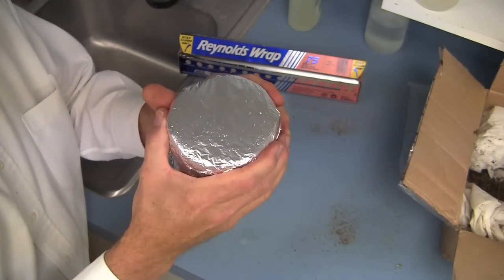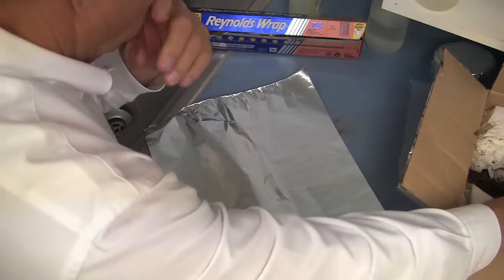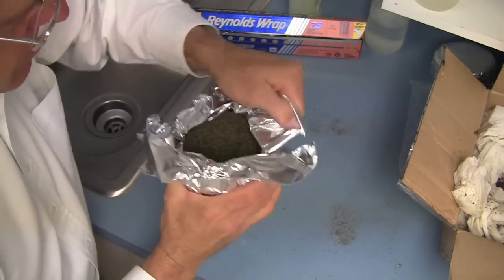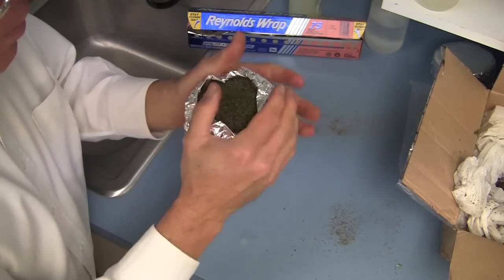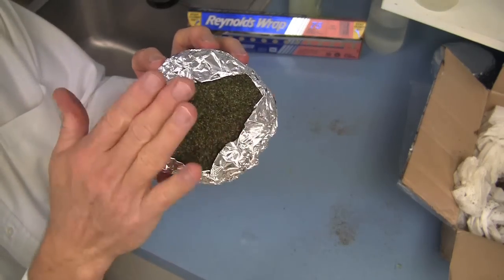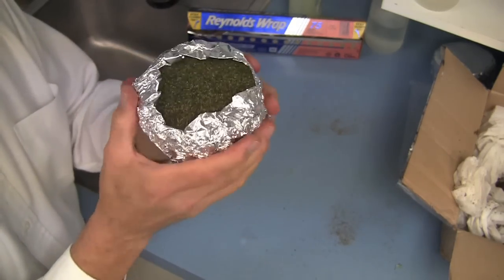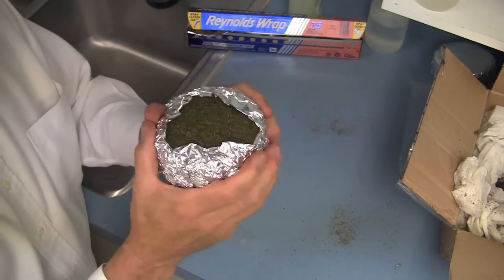That's a very simple, rapid way to pack a sample for shipping. Then you need to pack those into the box very tightly so that there's no movement. Another simple way is to wrap the aluminum foil tightly around the base of the sample and leave some opening at the top for air movement. This also works fine — I don't think you'd find a plant pathologist that would complain about this. Pack it tightly into the box so that it doesn't bounce around.